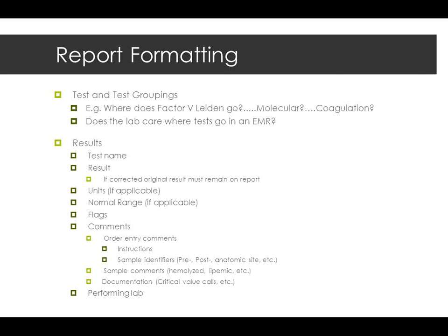In terms of the results, then, we need the test name. We need the actual result. If corrected, the original result must remain. The units, if applicable. Some tests don't have units. The normal range, if applicable. Flags, so high, low, critical high, critical low. Comments, so those order entry comments.